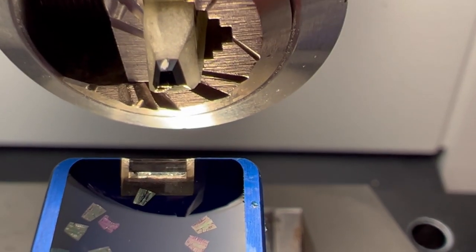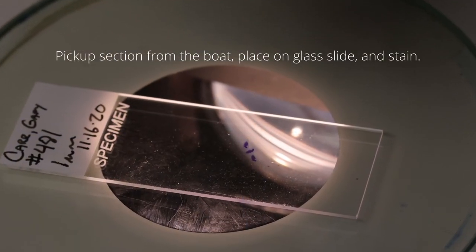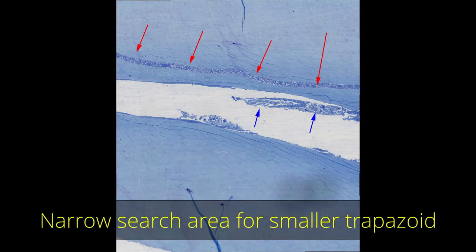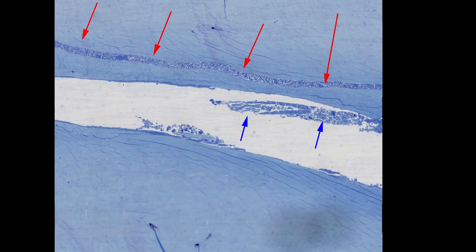Here I am creating the larger specimen sizes. Those are the green sections. Then I take those sections, place them on a glass slide, stain them with toluidine blue, and then create a narrow search area.